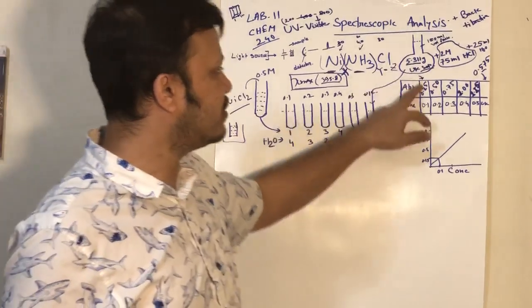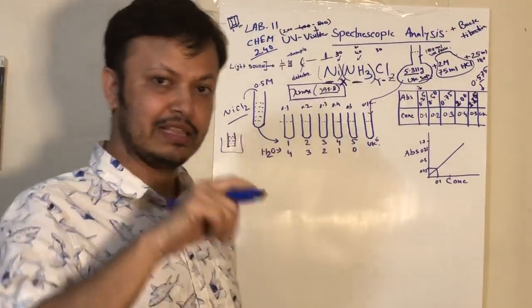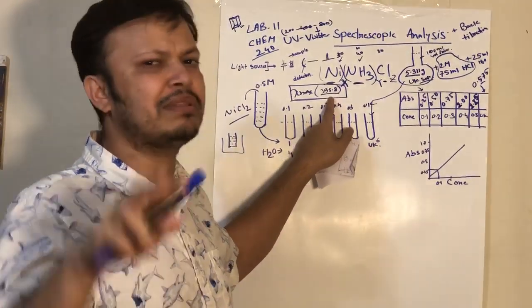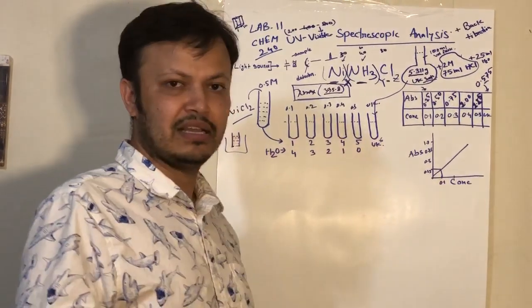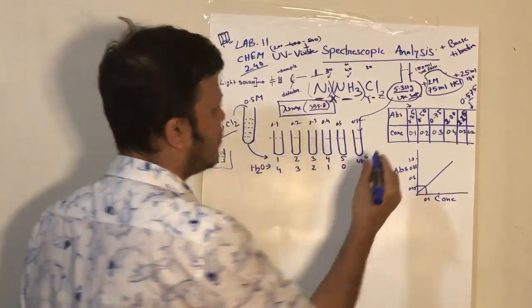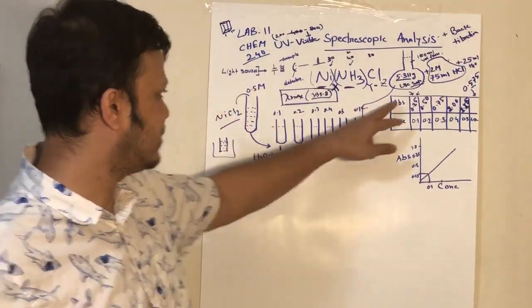When you are going to find out the absorbance, at that time you have to put in the lambda max. So in the computer you put this lambda max, 395.8. Whatever lambda max you get, you put that in, then run the sample, and you will see a point. Suppose the absorbance is 0.25. I gave you the data, 0.25.